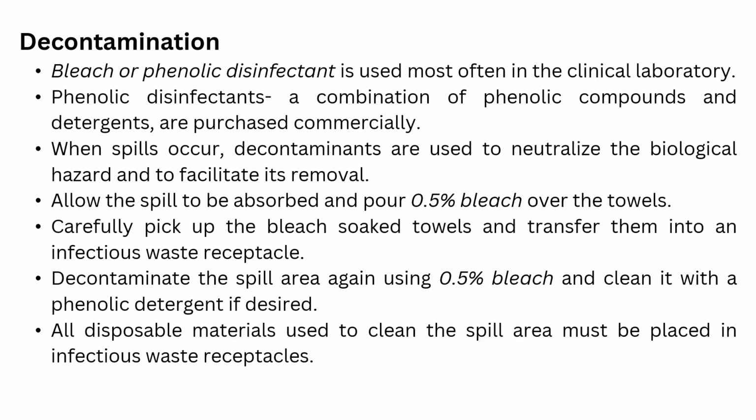After that, you carefully pick up the bleach-soaked towels and transfer them into an infectious waste receptacle. You need to decontaminate the spill area again with 0.5% bleach and clean it with a phenolic detergent if you desire. All disposable materials used to clean the spill area must be placed in an infectious waste receptacle and must not be reused.